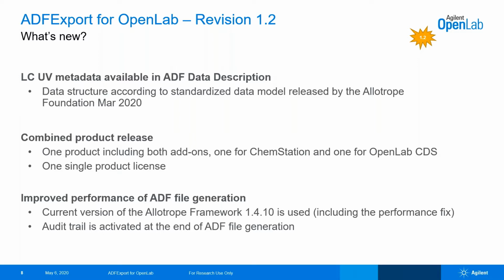A third major feature is the improved performance of the ADF file generation. So we use a newer version of the Allotrope Framework, and we activate the audit trail at the end of the ADF file creation.